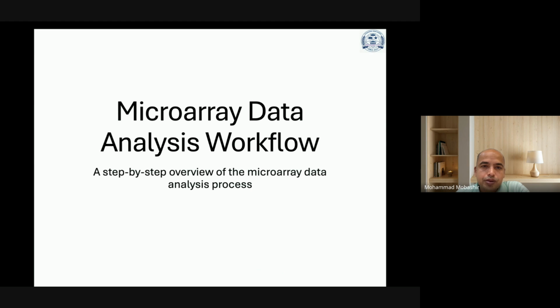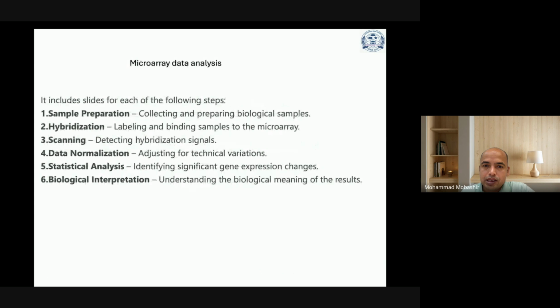Now I am going to present the workflow and the details for the analysis of microarray data. This microarray data could be for gene expression, SNP profiling, or any kind of high throughput data analysis. So here I will explain everything step by step for microarray data analysis.